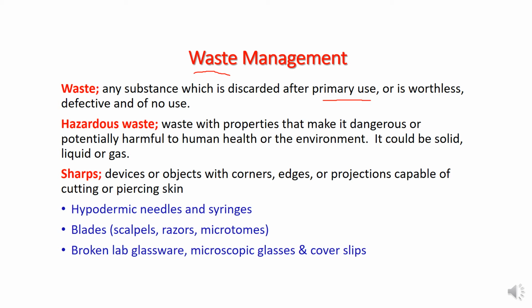Once you have used any chemical, after primary use it becomes worthless. Don't treat it as original, and don't put it back into the original stock bottle. Because you already used it, it is already in the active form and has already performed its function. After using it, you can just think of that particular chemical as waste.